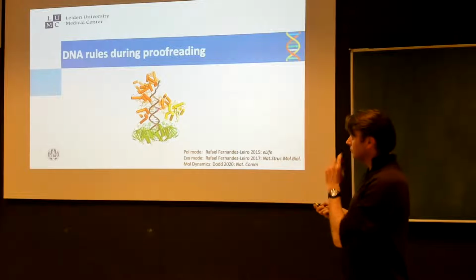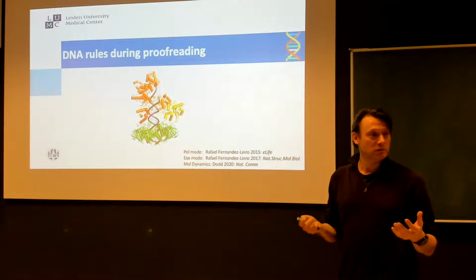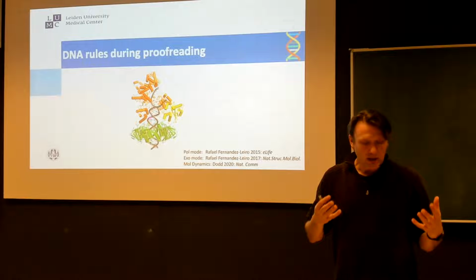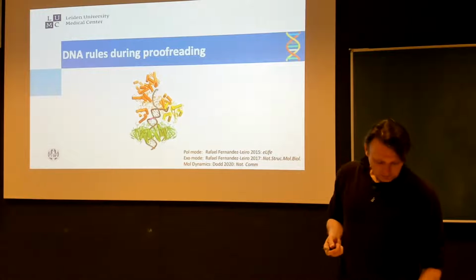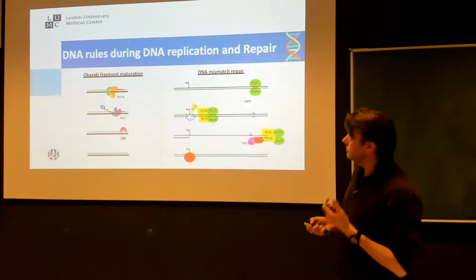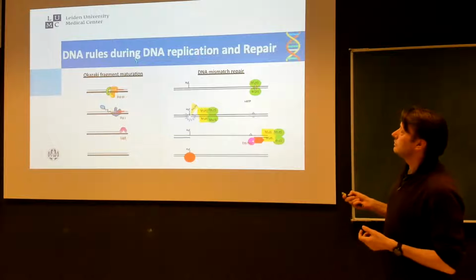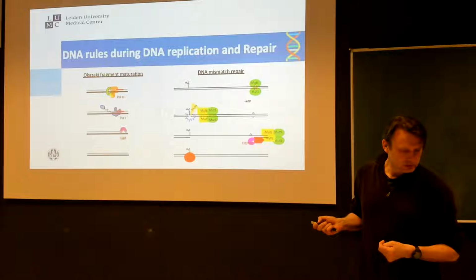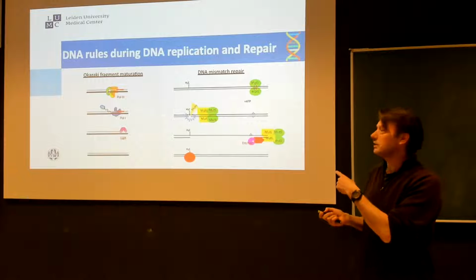And so this paper is actually called self-correcting mismatches during DNA replication, because it's the DNA that somehow is able to move from one site to another. Now, this turned out to be also a bit the case for 2 other systems. The resolution is very poor, unfortunately. Can you see this? Because it's very pixelated.